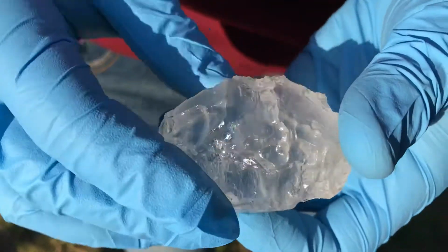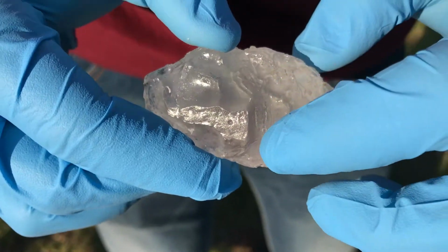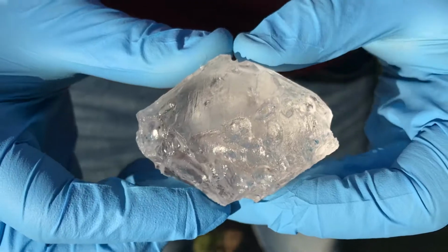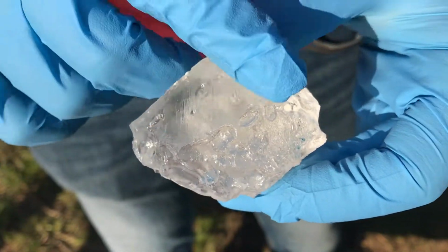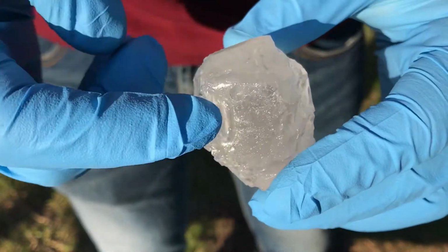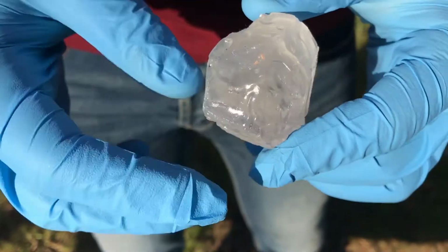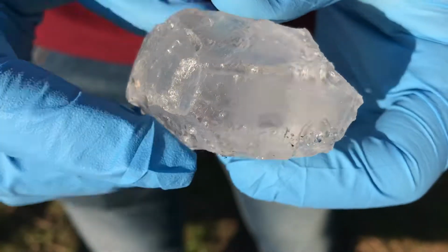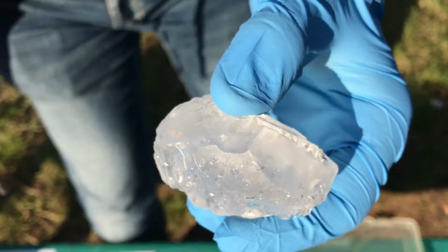The other one was contaminated with Turnbull's blue precipitate, so I had to wash the precipitate from the crystal. The water not only removed the precipitate but also dissolved some parts of the crystal, leaving some holes in it. Also, in some parts, the crystal has a bluish color left from the Turnbull's blue reactive.